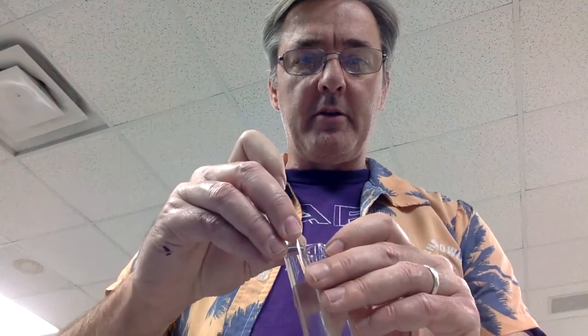This is the banana. So as you can see, it now has the banana separating from the starch part, separating from the solution part. So the part that's dissolved, the glucose dissolved in the water, is separate from the starch part, which is a pellet on the bottom.